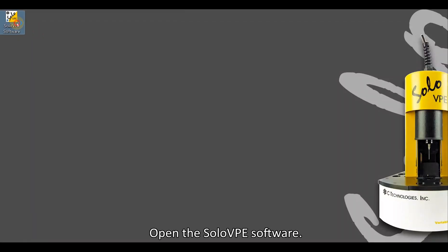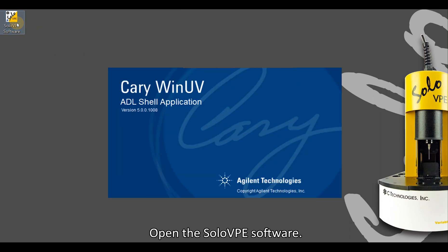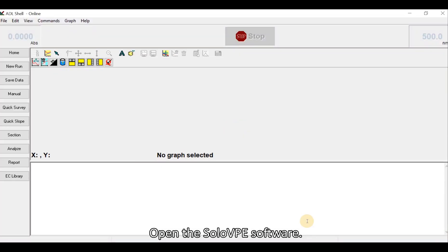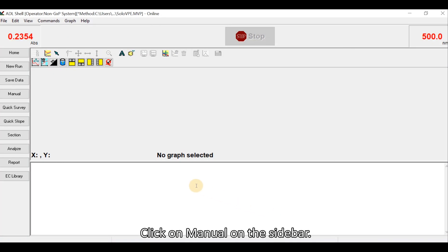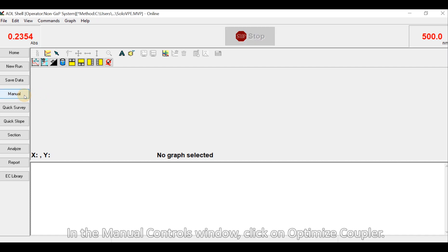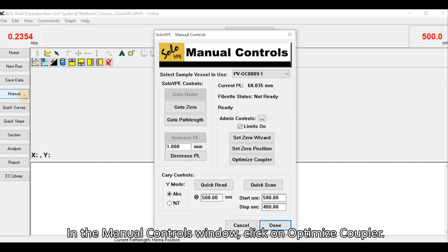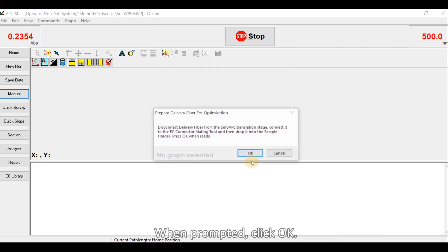Open the SoloVPE software. Click on manual on the sidebar. In the manual controls window, click on optimize coupler. When prompted, click OK.